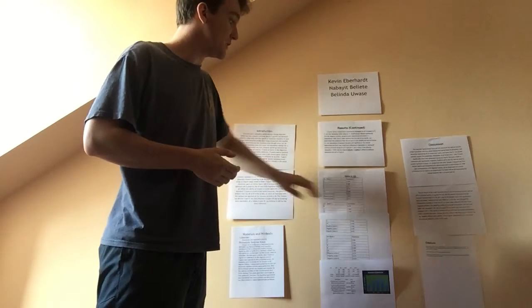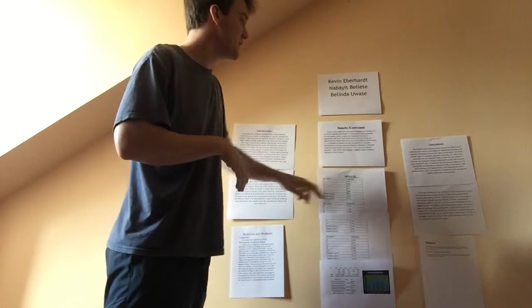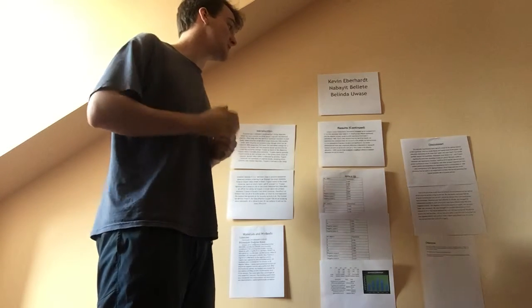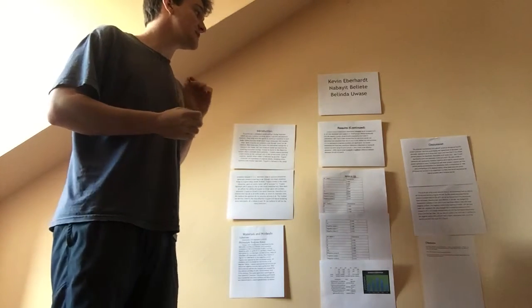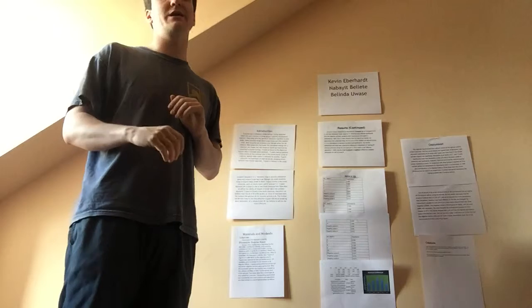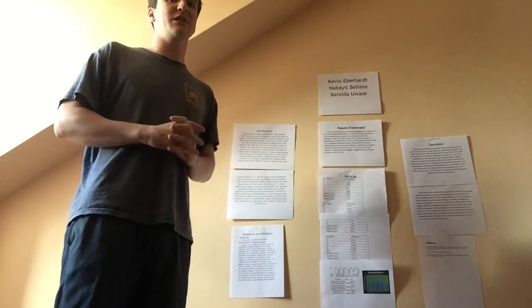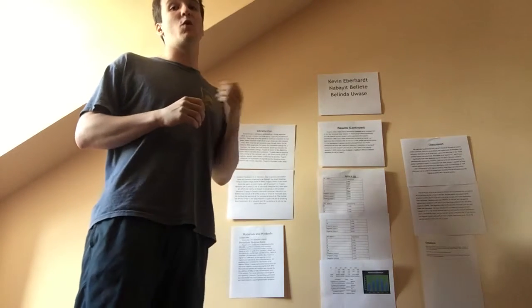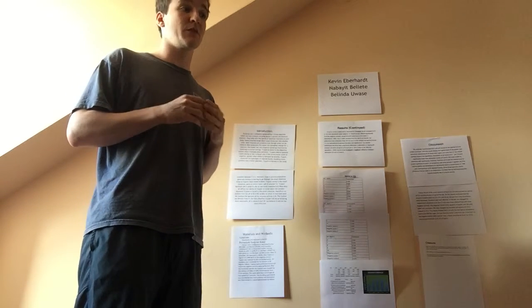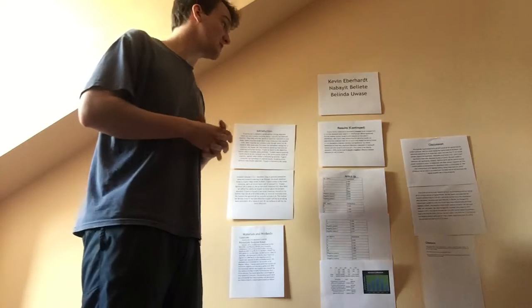So we do have this clear trend, as we were expecting, of absorbance going up to 8 and then down after 8. However, with statistical analysis, we did not have a statistically significant difference between pH 9 and pH 8. We did for all of the other levels, but between pH 9 and pH 8, we did not. So we cannot say that pH 8 was the most optimal or more optimal for the protein hydrolysis than pH 9 because there was not a significant difference there.